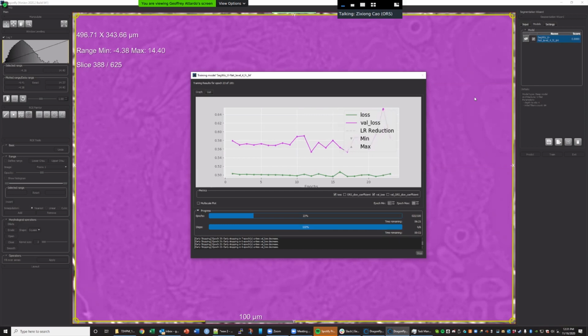In the future version, we will make it available in the wizard to do the full segmentation for the whole volume. Now in this version, you still need to save it. The button is here. It's not available now when it's training, but after training, you can save it to the main context. Okay. It looks like it's beginning to decrease now.